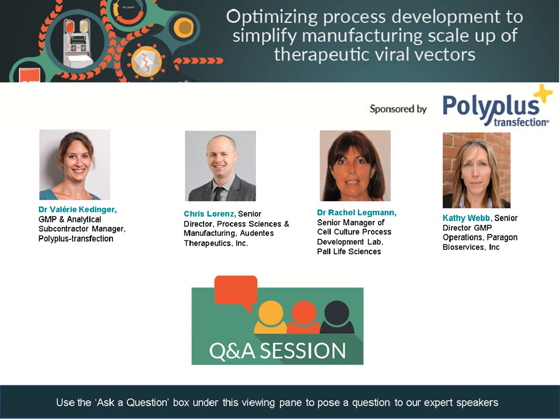Yeah, I think obviously that partnership is critical. A lot of these reagents, something like a PEI, of course, is a critical reagent for our process, to understand the variability lot to lot, and how that variability may impact our cell culture performance. A lot of these are unique or just coming to bear on the industry, where they have not been part of a previous licensed process that has been under more of a GMP or regulatory microscope.